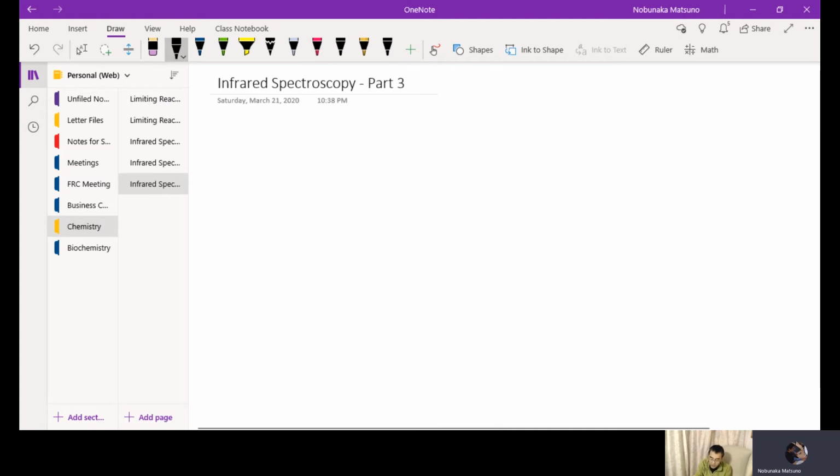Let's say you have carbon dioxide. I'm just going to draw the Lewis structure of carbon dioxide. Then infrared light comes in, the energy is absorbed, and this molecule vibrates. Here's carbon, and you have two oxygens right here. Each oxygen is connected with a double bond.